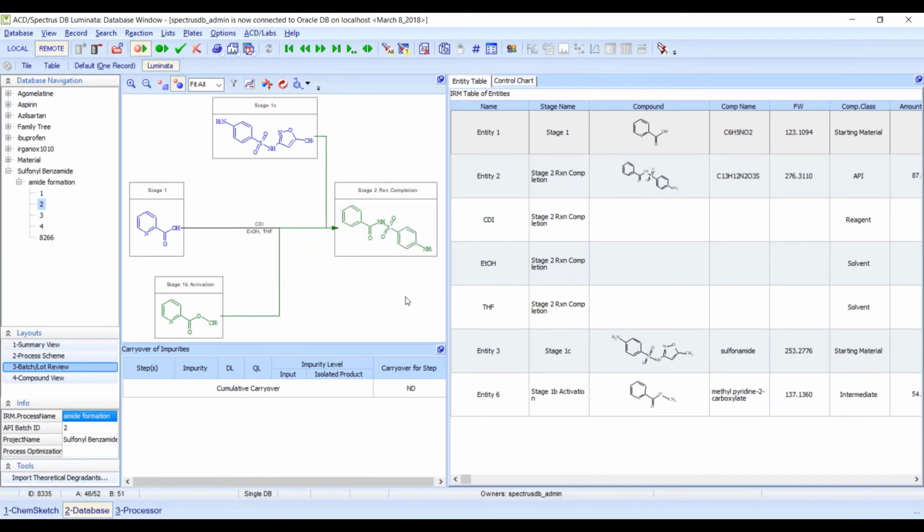Now, if you are doing these portions right now, currently, this is quite difficult to just obtain all your knowledge. So if, let's say, using an example that I've seen from other pharmaceutical companies that I've talked to, if you're doing this workflow, you may have put in a record inside an ELN, but at that point, you can't really easily link it, let's say, to a specific stage or a specific step. And if you do, you're putting a PDF. So let's go through and look at this activation portion right here.